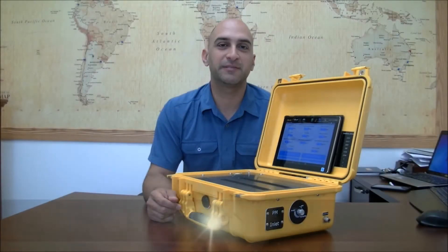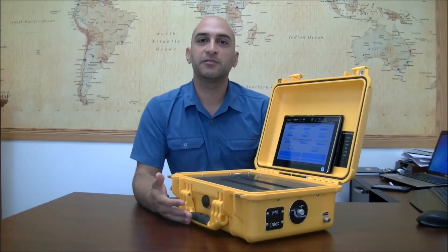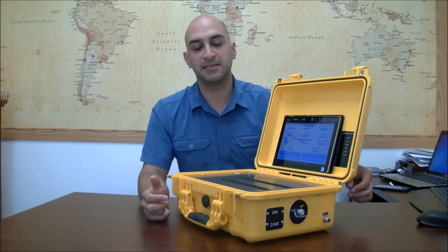Hello, this is Adam Ombakteri from Centroid. Here is a video to introduce not really a new product, but a feature of an existing product. You might have seen videos of the PoloTracker — that's our multi-gas analyzer — and here we want to show how the particulate sensor works.